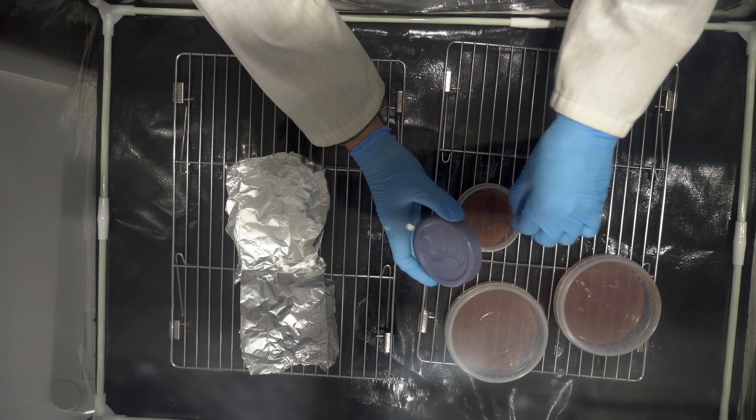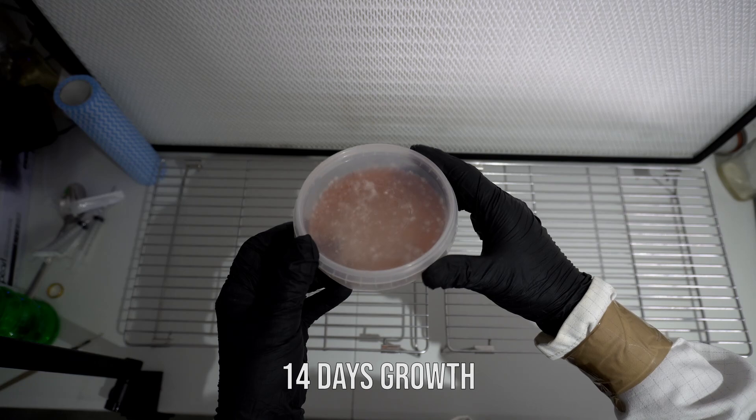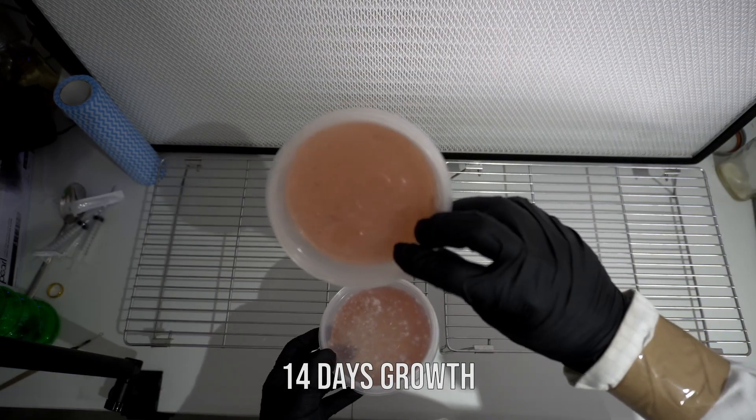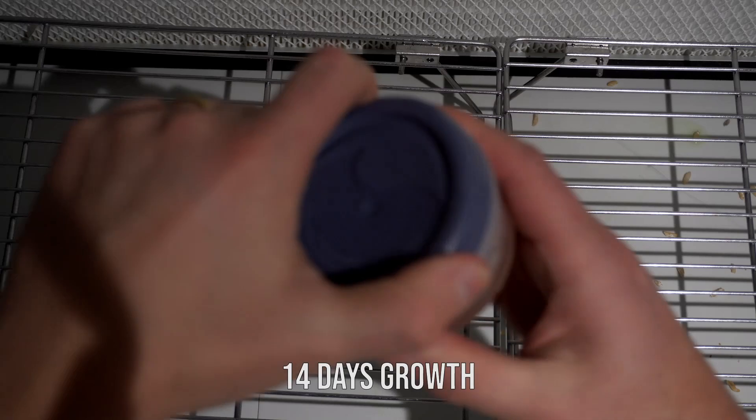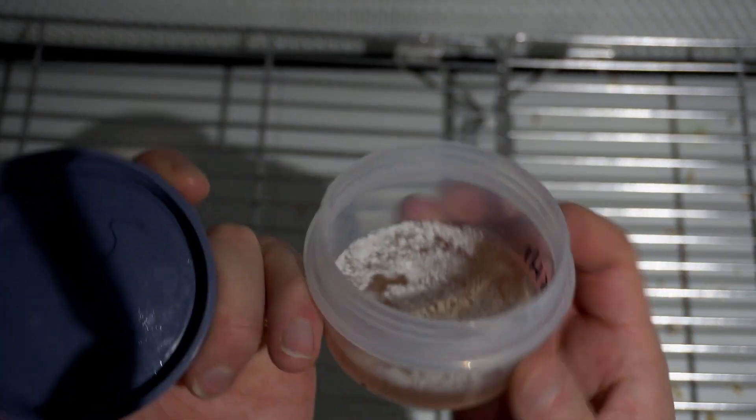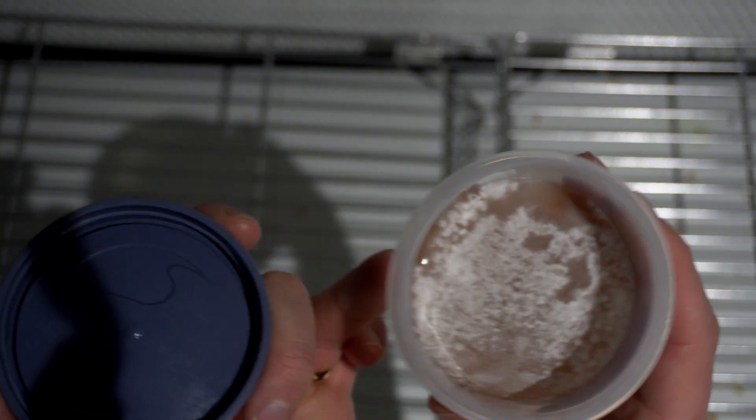This is exactly what I mean when I say it's going to look like chaos. Look at these plates, you can see colonies everywhere just growing. This one has contaminated. And this one's fully germinated, you can see this is just thousands and thousands of colonies. If you're doing this for the first time, you're not going to have a clue what you're looking at.